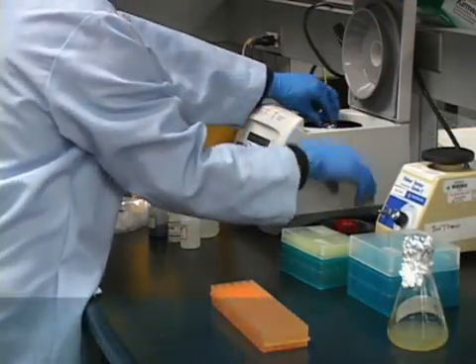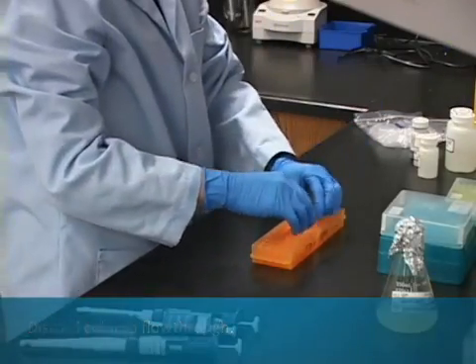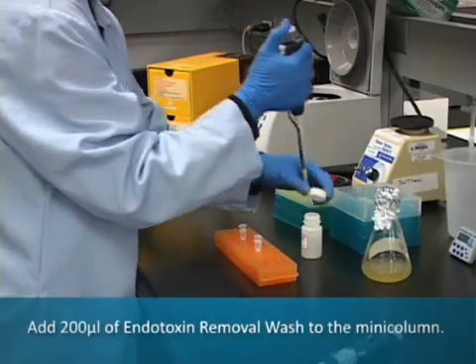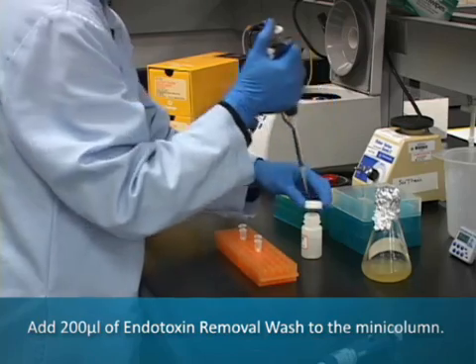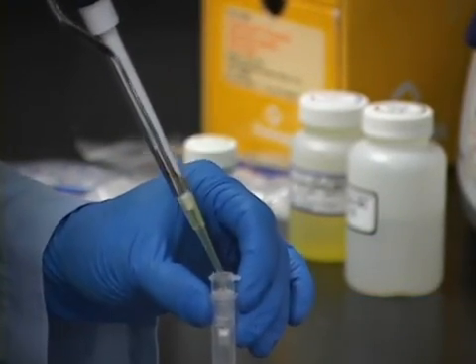Following centrifugation, discard the column flow-through. Next, add 200 microliters of endotoxin removal wash to the mini column and centrifuge at maximum speed for 15 seconds.